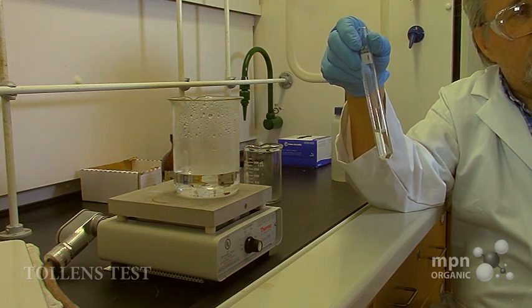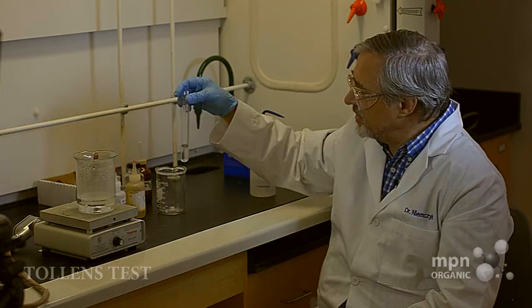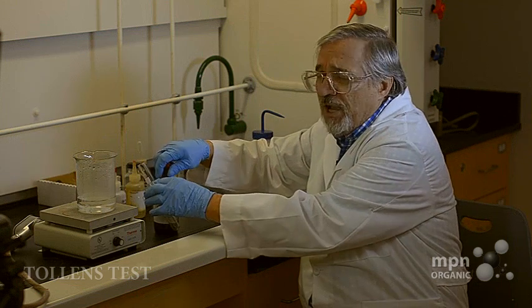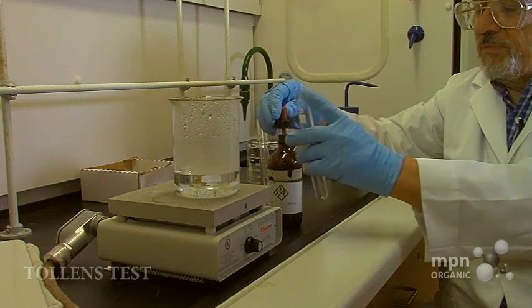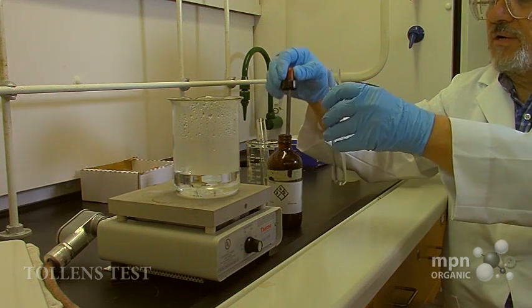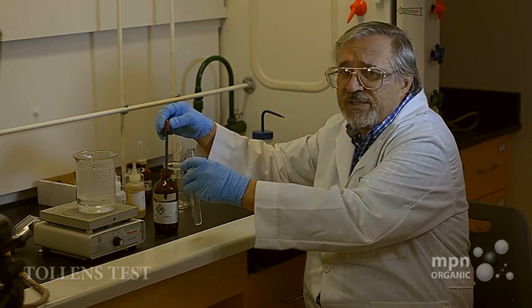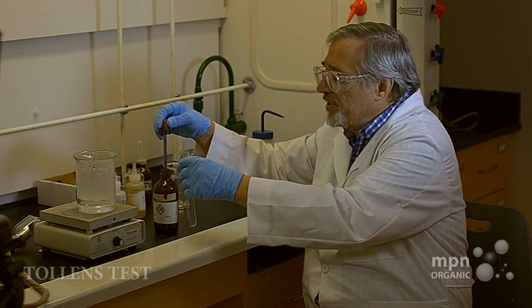So this aldehyde functional group is what we're going to see reacting in this test. So let's put this over here for the time being. To make up the Tollens reagent, it's actually very simple. Here I have a test tube, and the success of this hinges upon the fact that these test tubes are clean. You can't use a dirty test tube for this.